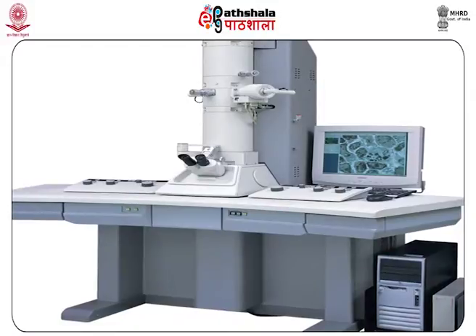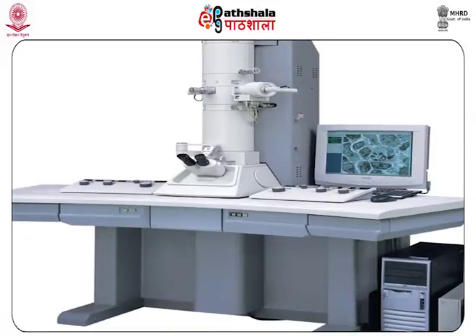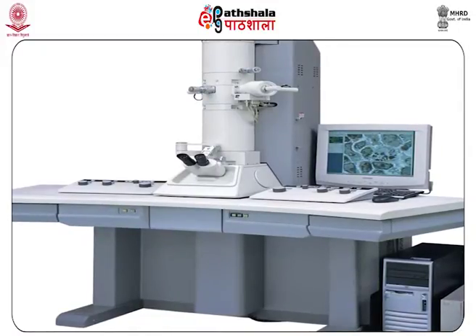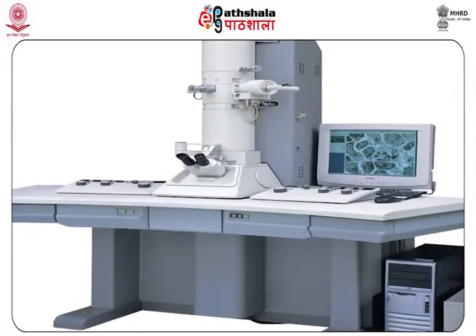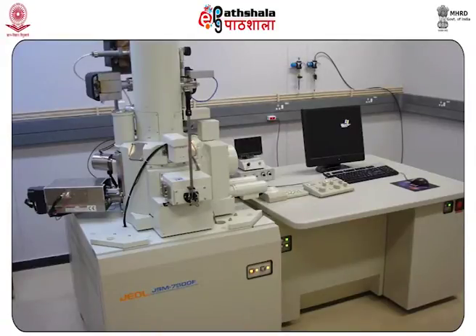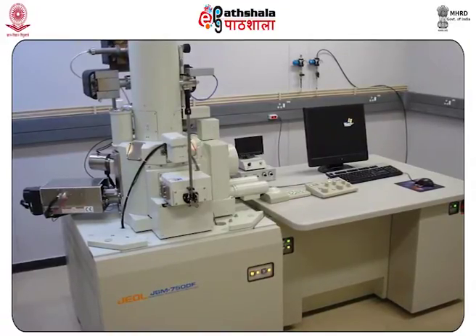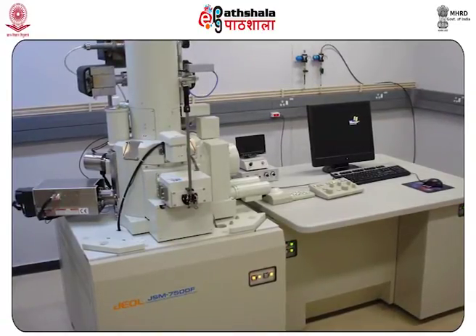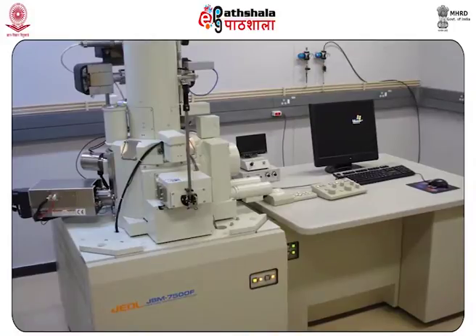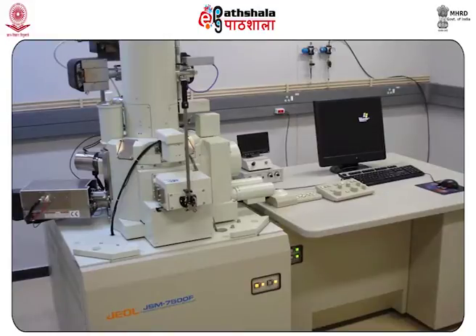Now, the electron microscope has high magnification. In certain cases, the magnification can be achieved up to 2 × 10^5 x. It is extensively used in the field of biology and other material sciences. In scanning electron microscope, a three-dimensional external shape of an object with greater depth of field can be obtained. Unlike the light microscope, which uses photons for visualization, the electron microscope uses electrons.